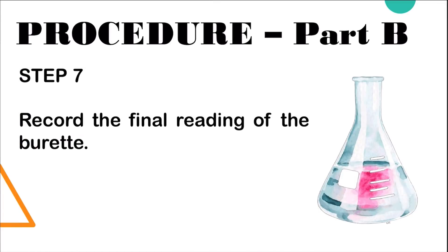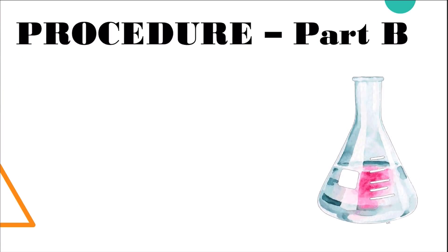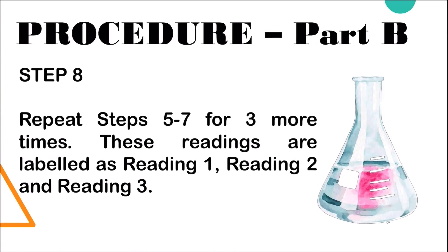Step 7: record the final reading of the burette. Step 8: repeat steps 5 to 7 for 3 more times. These readings are labeled as reading 1, reading 2, and reading 3.